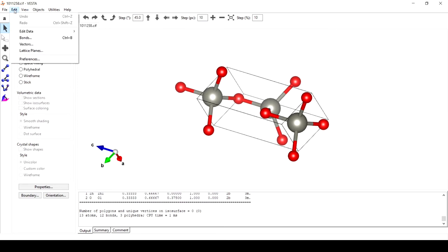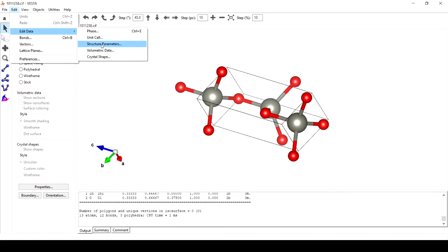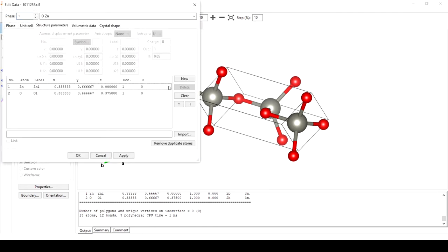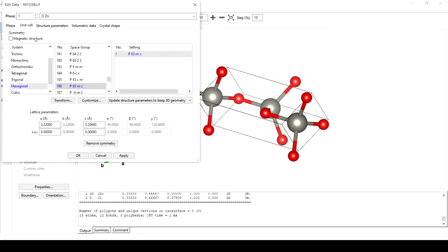For this we will go to edit data structure parameters. Here we will go to unit cell and then transform.